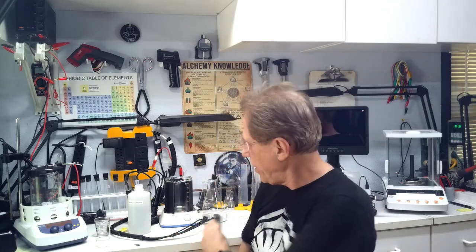Welcome to Alchemy Wizard. I'm Tom. Today we're going to show you a bit about the laboratory experience. Not everything is all glitz and fun — my polished videos have a lot of polish on them.